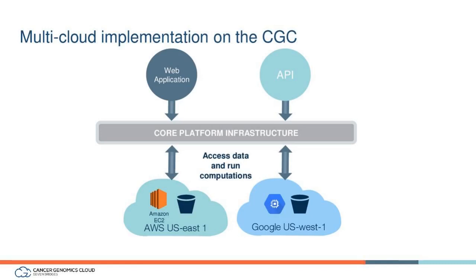And this makes the platform very flexible because a lot of times users are concerned, maybe they have a sequencing center that's delivering BAM files or VCF files on a Google bucket. They don't want to pick the wrong cloud. So now you can actually interchange across different clouds, and you're able to analyze the data where it resides, saving time and your funding as well.